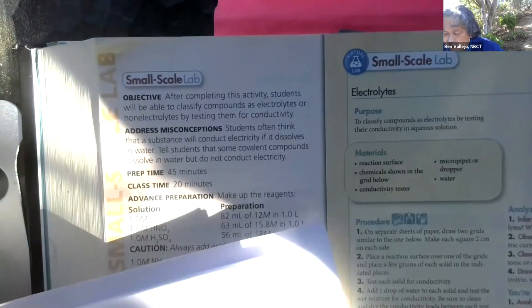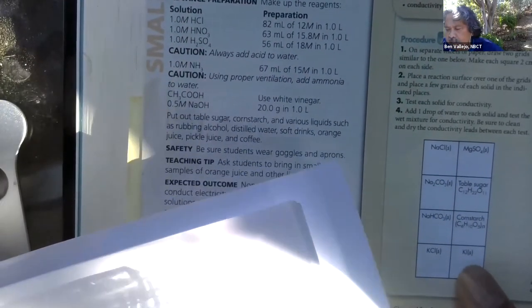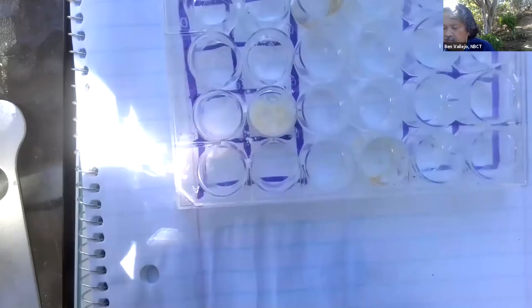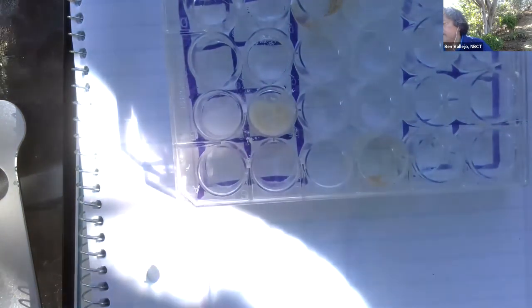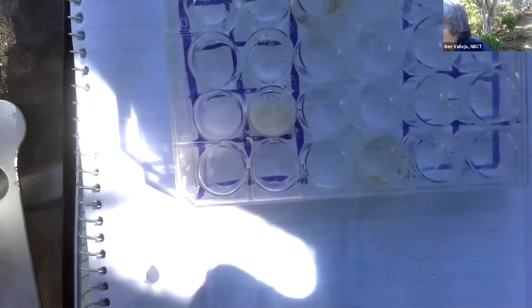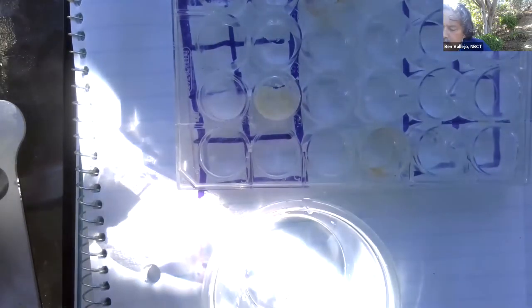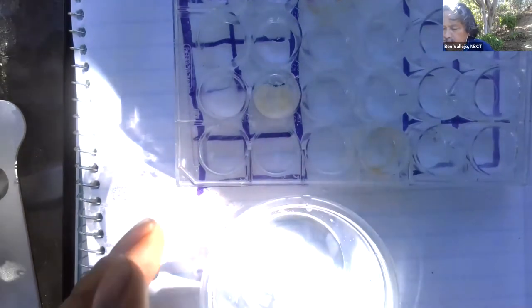Okay, so positive. Now, the other thing that I thought we had, and then it's like, oh, it says solid, is KI right here. Wait, you can't see that. Right here, KI. And we have some KI in our kit, but it's already in solution. So this is mostly water with 0.1 molar potassium iodide. So I'm gonna put a few drops of this in here, enough to test. Okay, I'm gonna take my electrode and rinse that off one more time. Okay, and then let's try that.